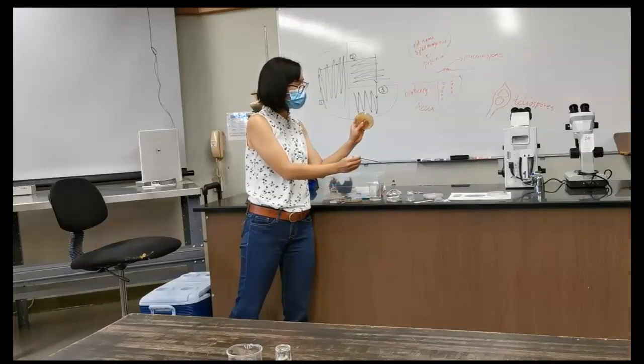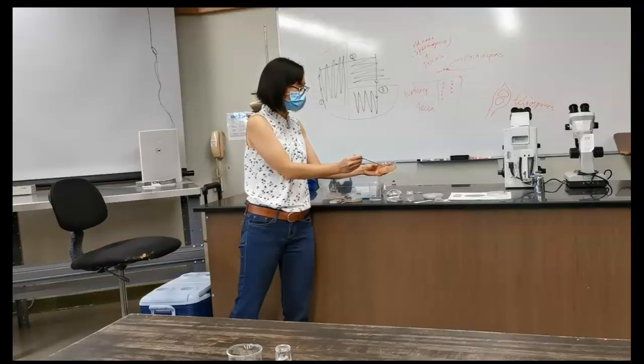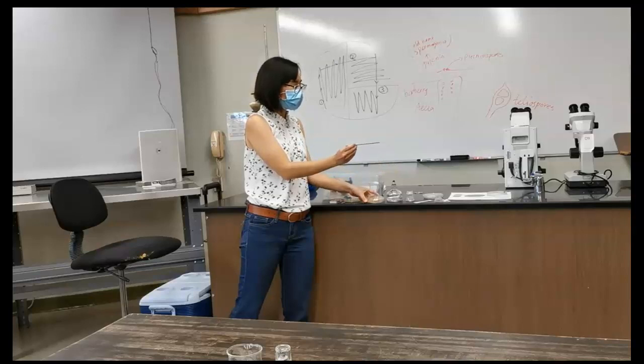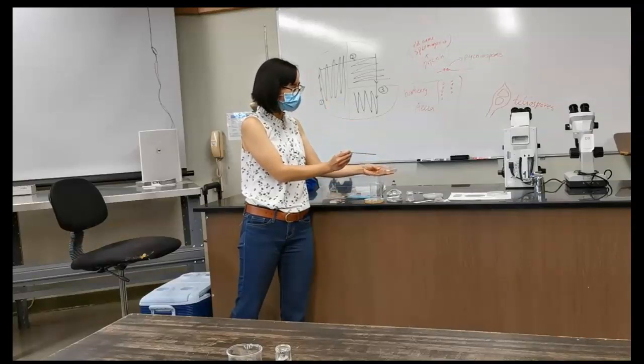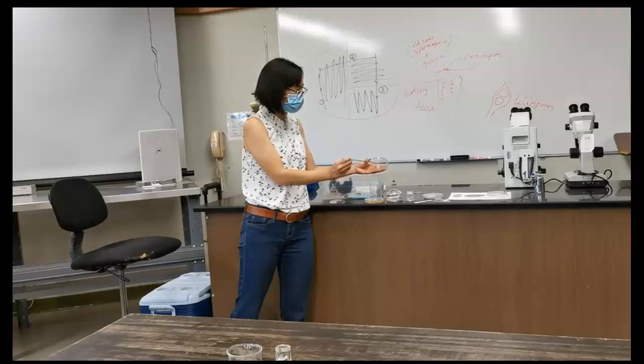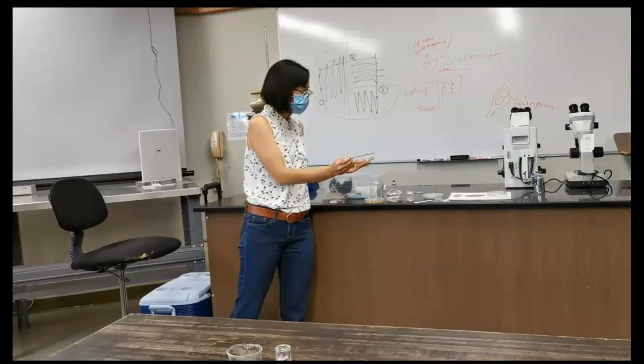And now I'll open the mother plate, and I'll move towards the flame as well. And then just sample some bacterial cells. And then I move this clean plate, open carefully around the flame, and then draw zigzag lines. After that, I burn the loop, get rid of the bacterial cells, and then dip in the ethanol, then burn the ethanol.